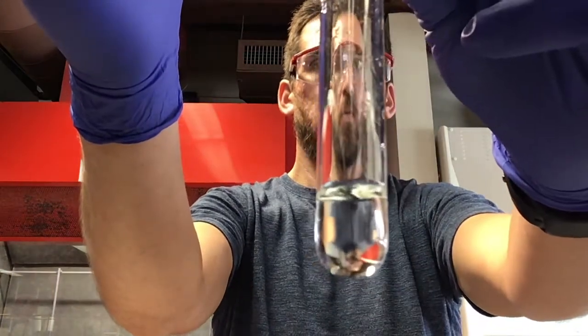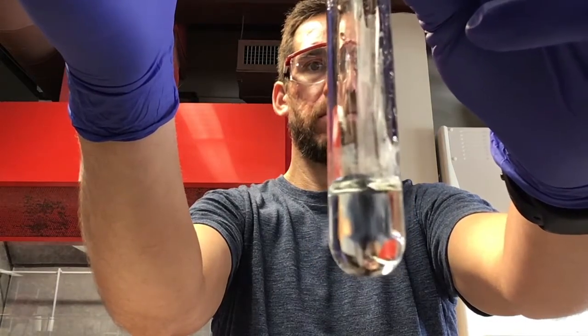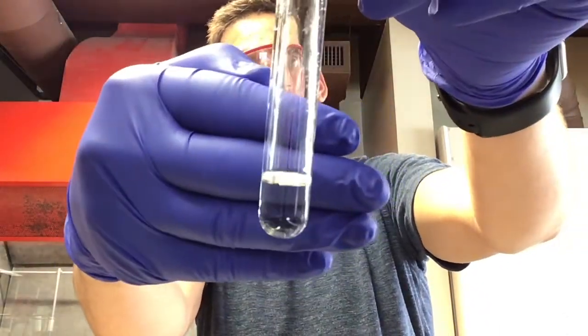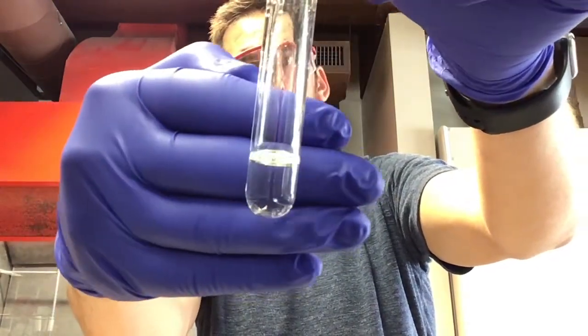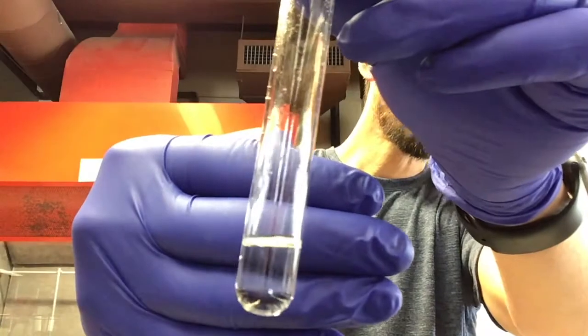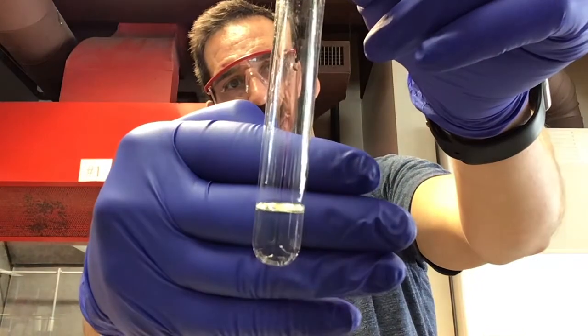Okay, so we've got 1, 2, 3, 4 drops. Just keep an eye on that for a little longer. All right. So, set that aside for now.